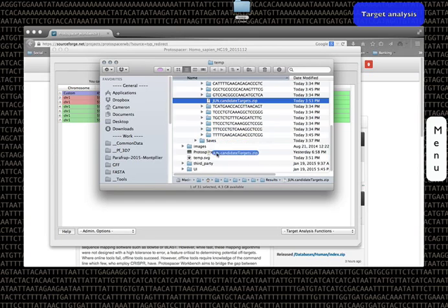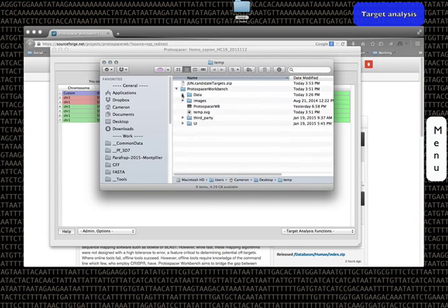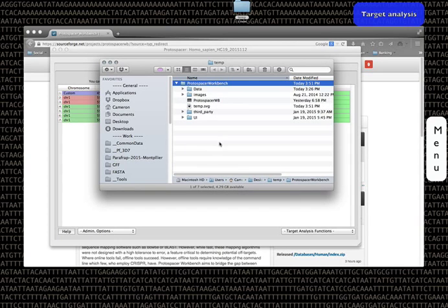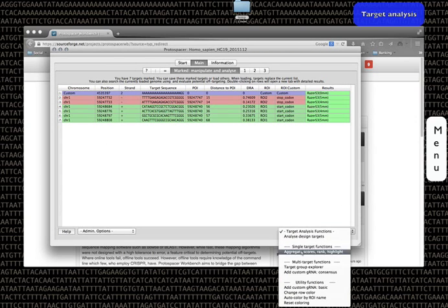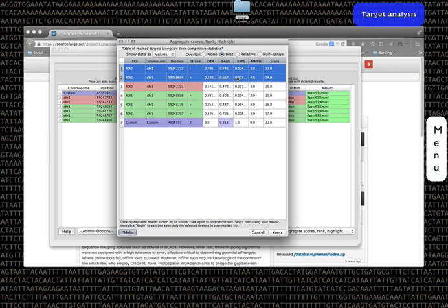If you go to the Information tab in Protospacer after loading a database, you will see that there's such a thing called a hash key. This is the MD5 checksum for the sequence data of the genome. Even if one nucleotide is different between genomes, this MD5 checksum will be different. This is for peace of mind and to ensure that results from different genome versions cannot be mixed.